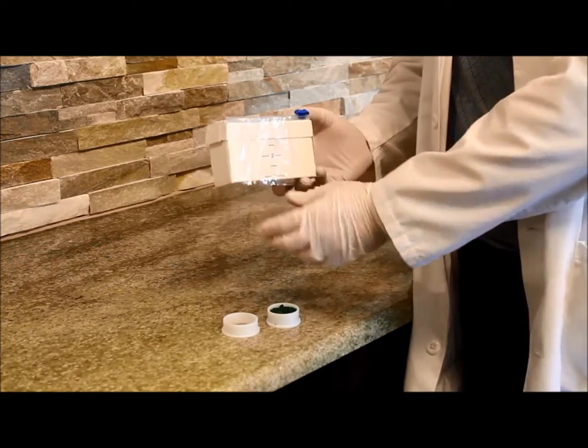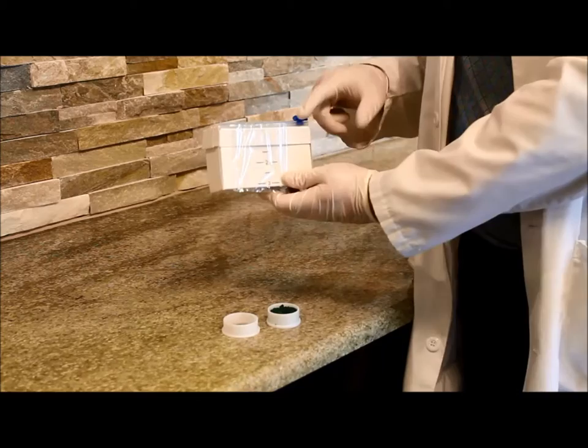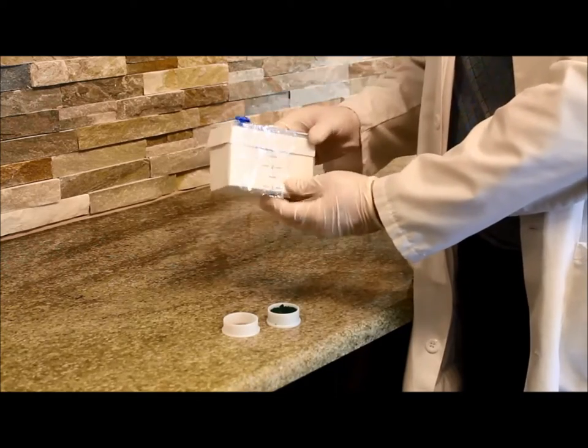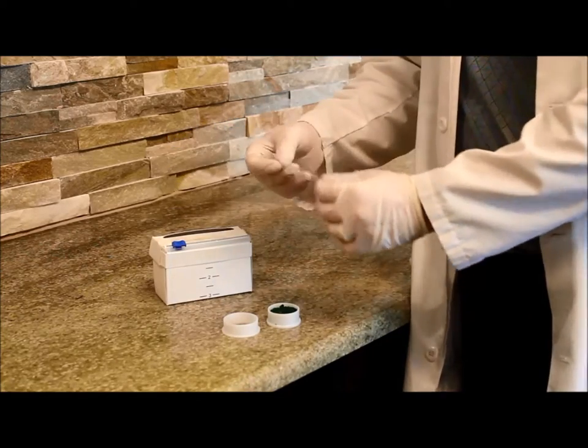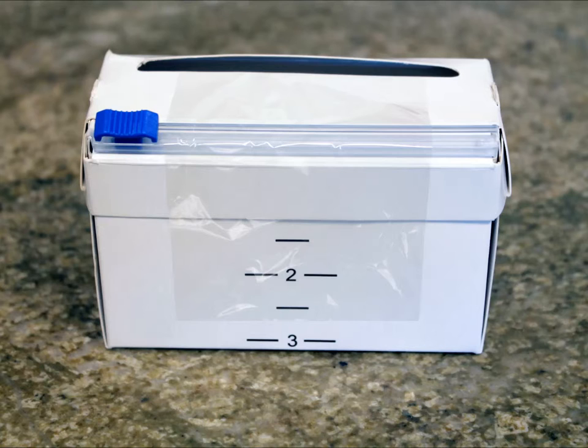Please note the inch graduations on the dispensing side of the box, allowing for easy measurement of the film to be cut. The improved height of the Skybox allows for dispensing of film to accommodate the largest of sample cup diameters.